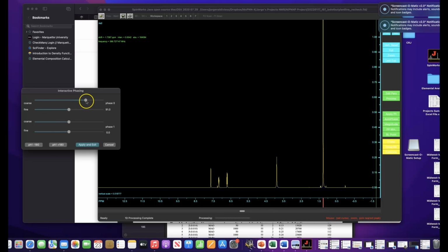So we've essentially adjusted everything just with the top coarse. That's where I would start, and then you can do anything with the bottom, but see how one side gets adjusted while the other does not. As I'm adjusting with the bottom coarse, everything on the left is being adjusted versus everything on the right is not. So just be careful with that. First start with the top, and then anything else, go to this second one.